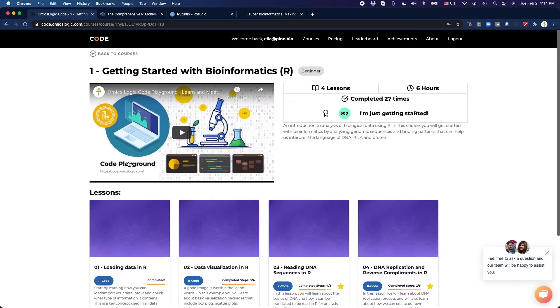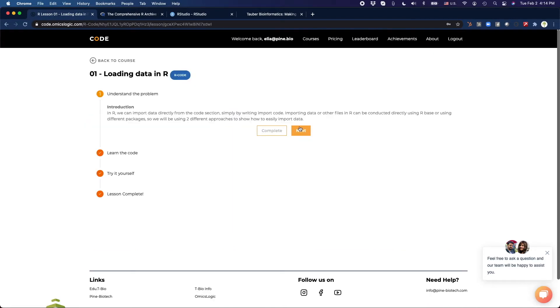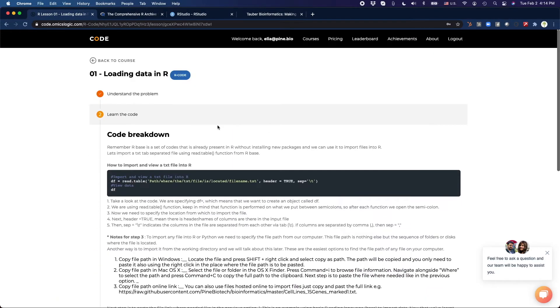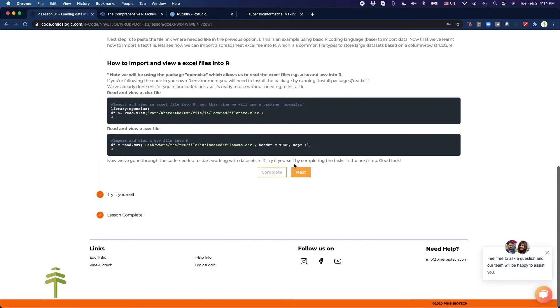We click here, you'll see a brief overview of why we started the Code Playground, and you have the first several lessons that you can start working on. Just read about the code and then try to do it yourself.